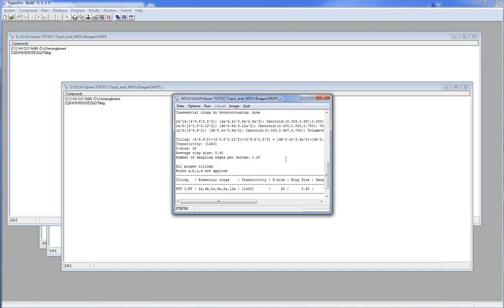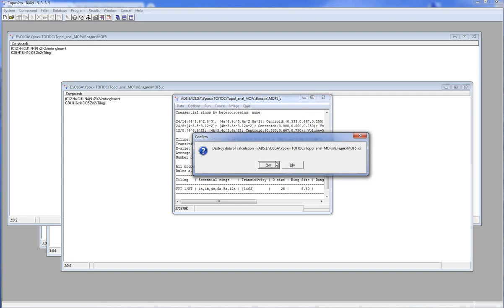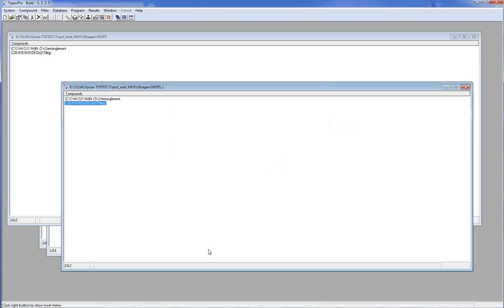So, you can use Topos Pro to perform a really comprehensive topological analysis of a particular MOF. This analysis is universal and enables you to find relations of this MOF to other structures with similar topology.